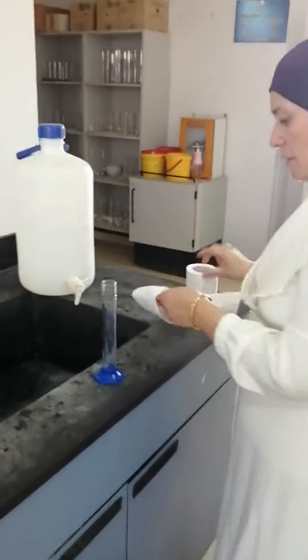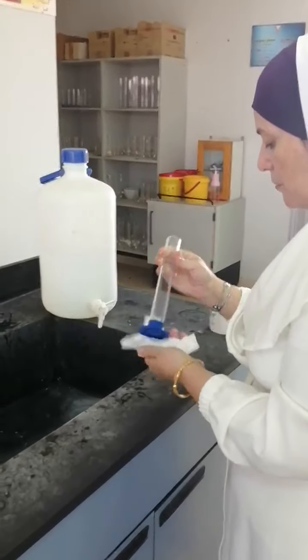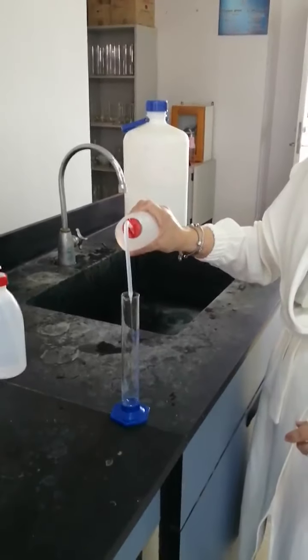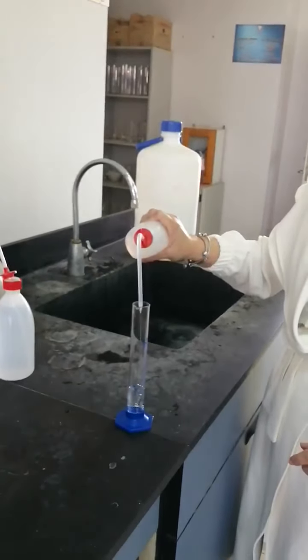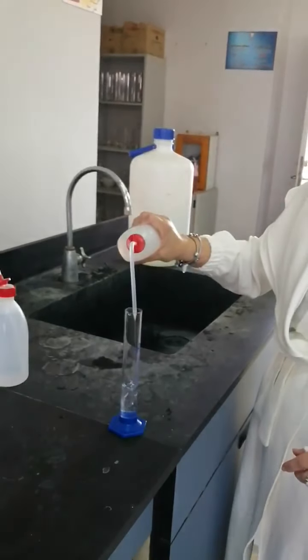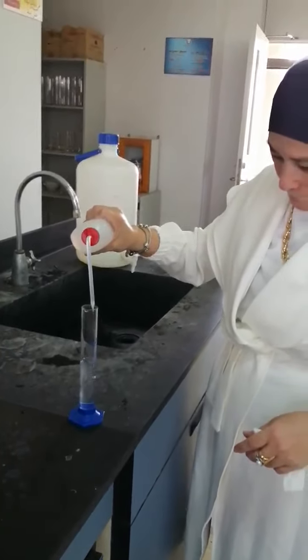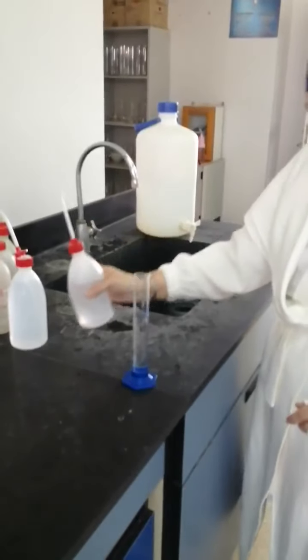Dry it from the outside to get accurate results, and dry the base, then just add 50 ml of water and reweigh it as W4.